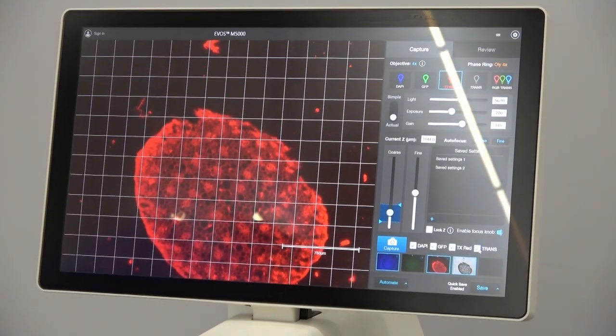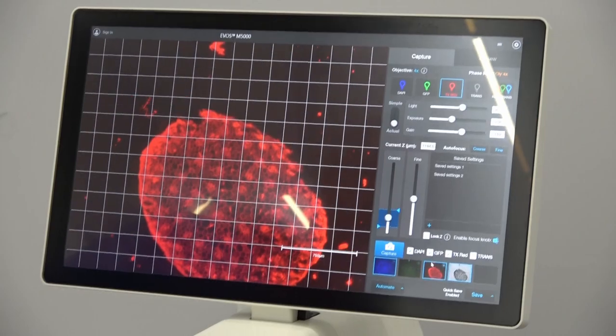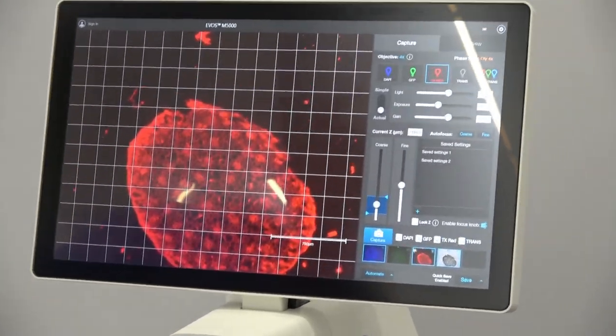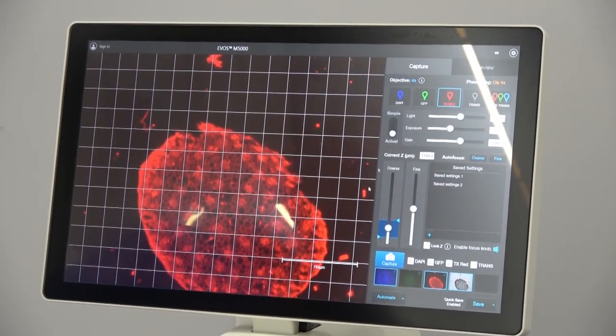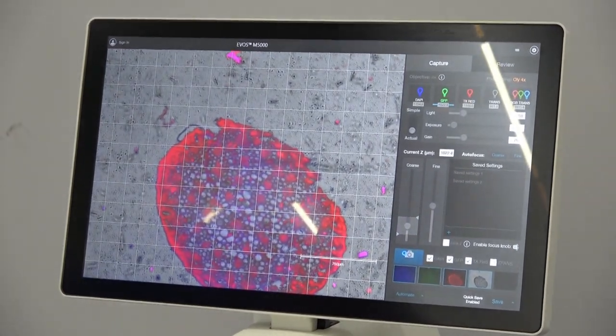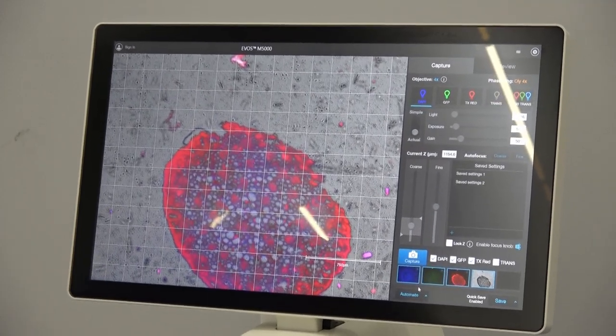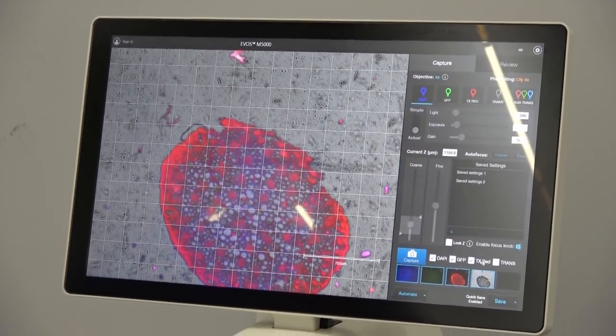You can turn off which colors you're going to capture by just using your check boxes here. Again, tell it to capture.